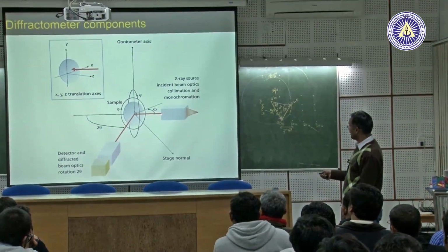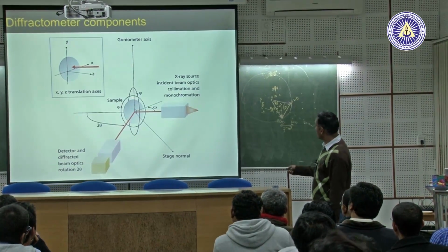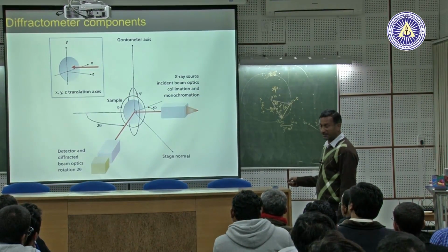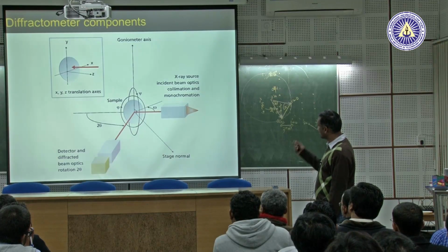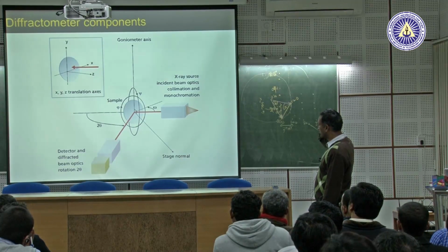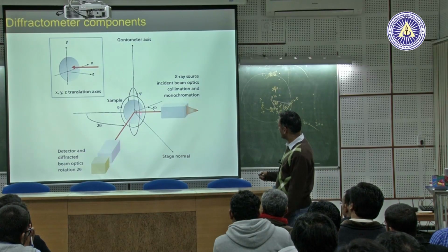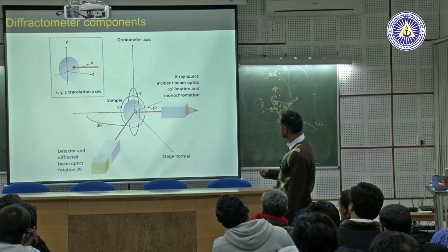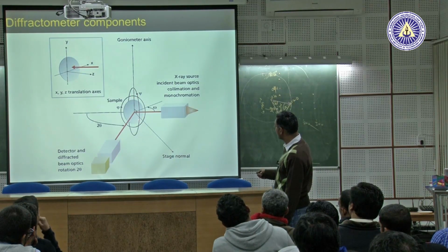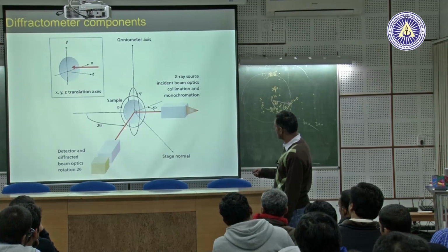The key thing about reciprocal space is that phi is about the stage normal. Phi is about the stage normal, and psi is. What are the axes? If you identify the axes, it will be easier. Here, in general, you're just talking about mainly, which is the axis of psi? Rotation. This psi. No, that is for phi. Phi is for this, the stage normal.